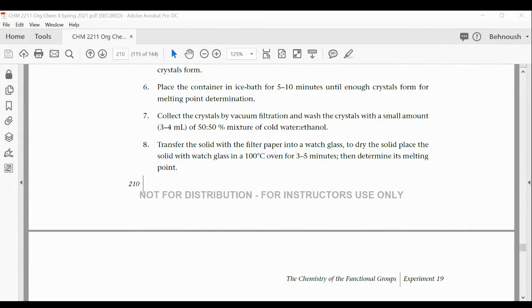The theory for aldehydes and ketones is very similar because both of them are carbonyl compounds. And the discussions and the reagents that give positive for both of them, or positive and negative, are just a limited number, so you don't have to worry about separating the paragraphs. So it's going to be very similar.